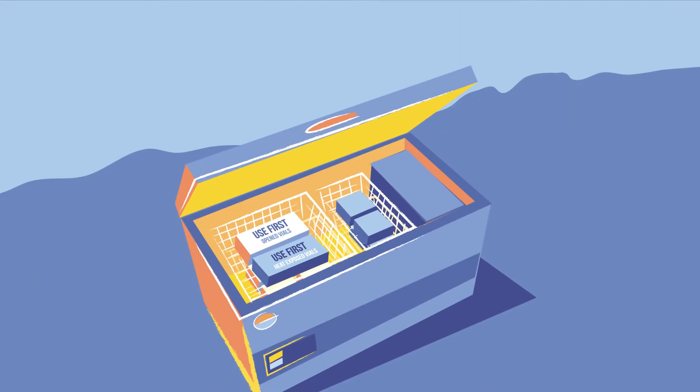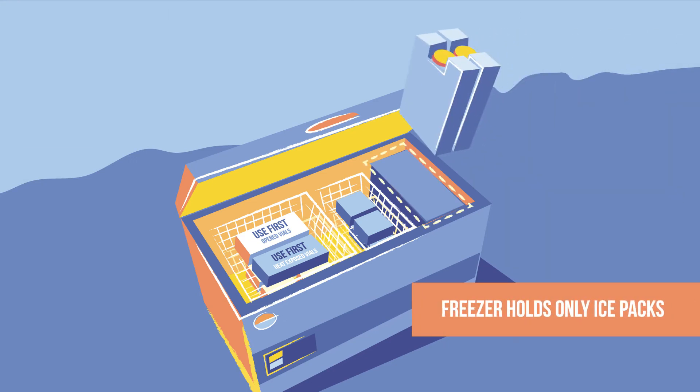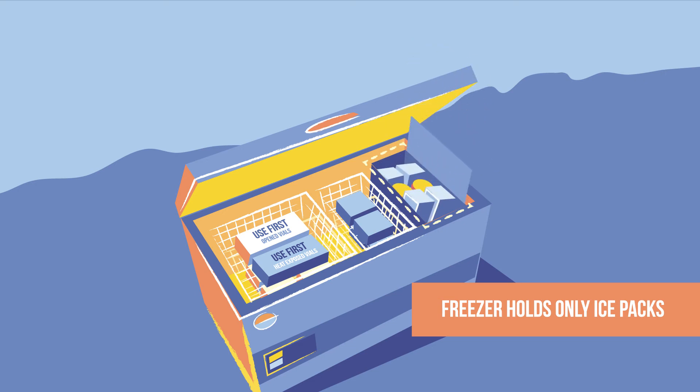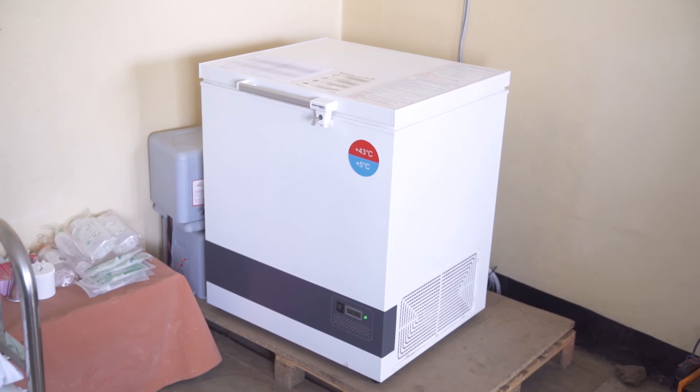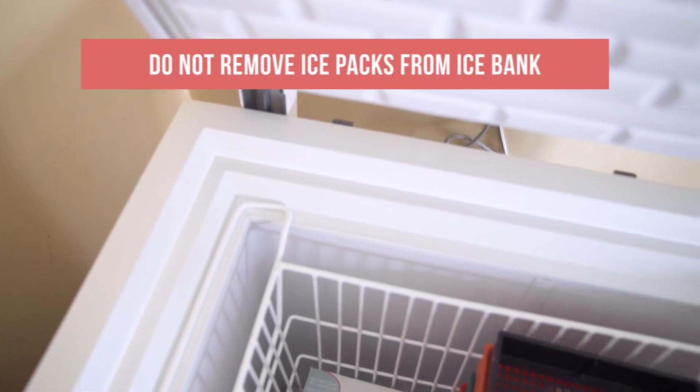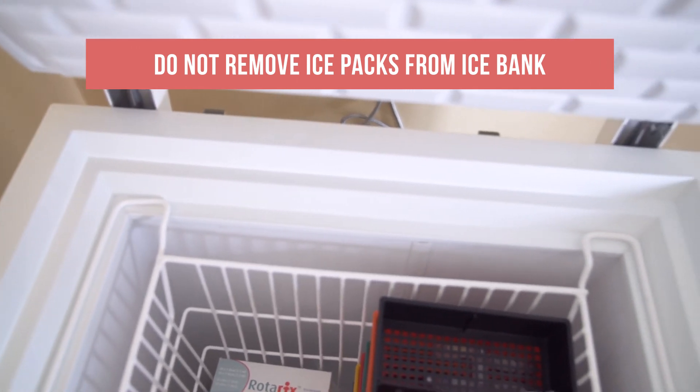Take a closer look at the freezer. Remember, this compartment should hold only ice packs, and the internal lid should be kept closed before closing the main lid. You may have a solar direct drive model with an ice bank instead. If you do, never remove ice packs from this area.